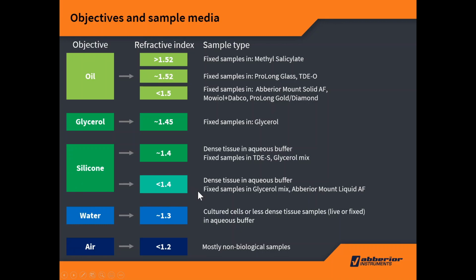Also, you need to know that for many of the curing or mounting media, or media which need to dry to harden, you will find that depending on the time you use for curing, you will have different refractive indices in this medium, and again maybe a mismatch to the immersion liquid.